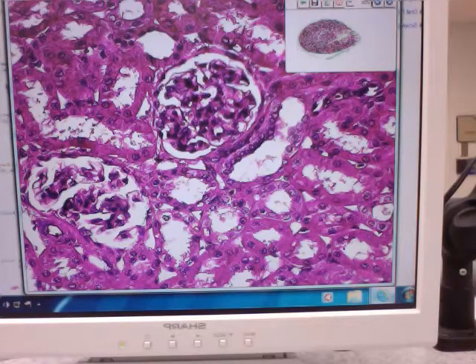And then when you look around the rest of the slide, examples like this one, you see further examples of what would be simple cuboidal epithelium. You can see where the nuclei are. You can see how the cell, here would be about where the cell boundary would be, another one here. You kind of picture the boundaries between the cells and see that their height, width, whatever, it's all basically the same. It's a little cube. So an example is simple cuboidal. There's only one layer of cells, cuboidal in shape, simple cuboidal.